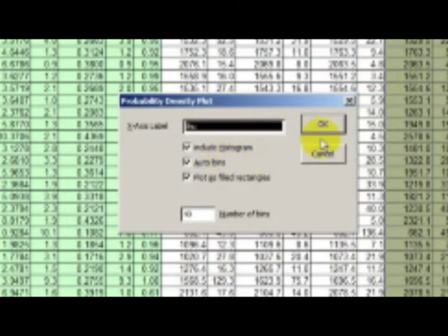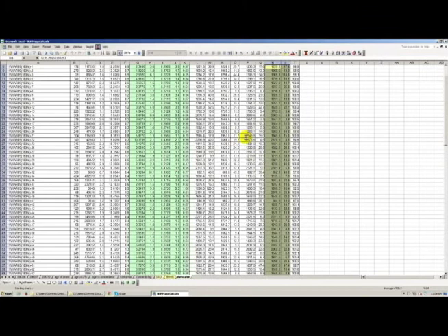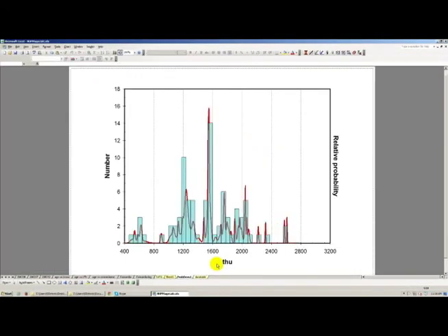It doesn't really matter what you select here. You can click OK again. We just want to take a really quick look at the data. Okay, so what you can see from this plot is that there aren't many grains around that age, that is the threshold around 900 Ma. But there's this one grain, so there's nothing at around 800.